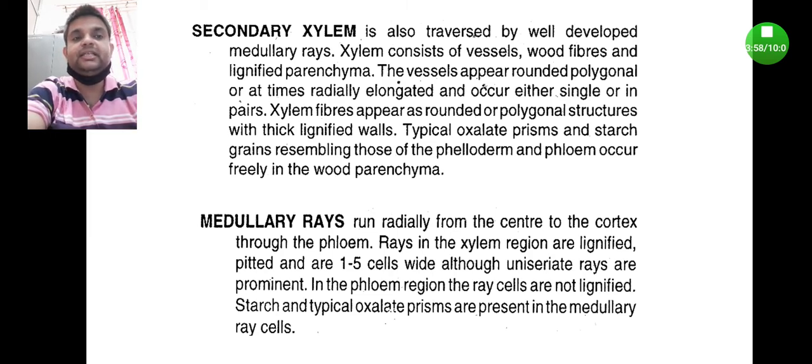So in brief, these are the various microscopical features you will observe under the microscope for the Rauwolfia root. What are the things we are going to observe? The first one is cork, which is stratified cork. The presence of stratified cork is the characteristic feature of Rauwolfia root, which consists of both smaller and larger parenchyma cells, both suberized. The smaller one is non-lignified, whereas the larger one is lignified.